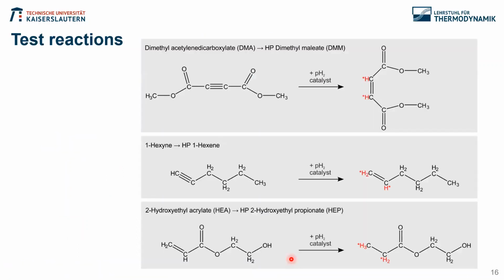So if you want to do reaction monitoring, it's good to have an initial test case to see which kind of signal to noise you get, and if we get a high peak cancellation because the shimming is not so good, and stuff like that. So we chose 3 different, very well-known PHIP reactions to have a look at that.